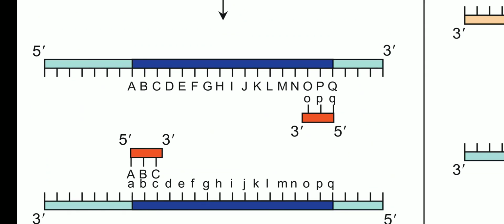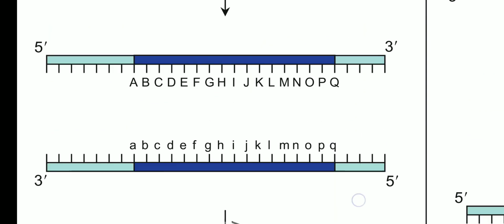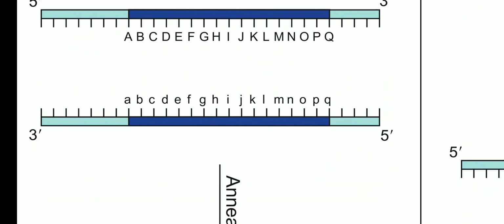The primers are designed in such a way that they go and bind to a particular oligonucleotide base sequence present in the desired DNA region. So it only amplifies the deep blue colored region. But in the very first cycle we have these two strands, and they will remain continuous throughout the cycles and will replicate once in each cycle.